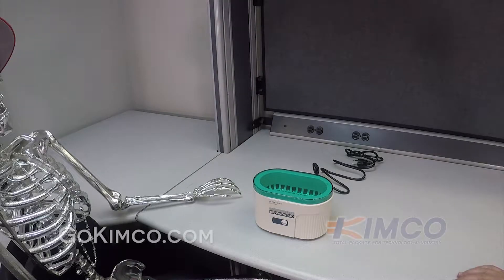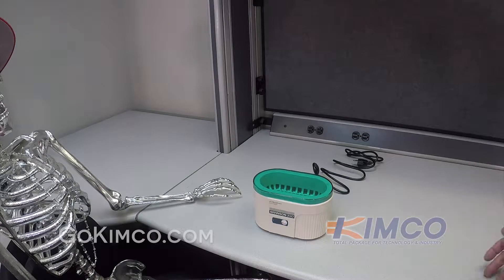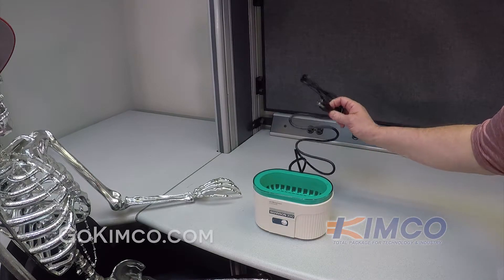Here we're going to do a demonstration of the Branson B200. Before you start, make sure it's unplugged. It is.